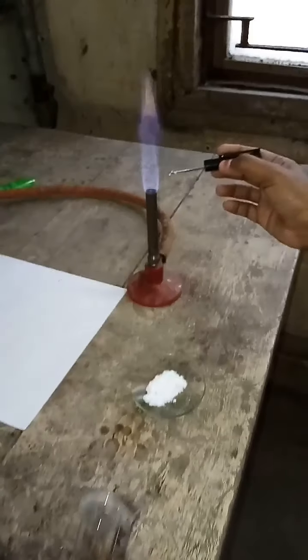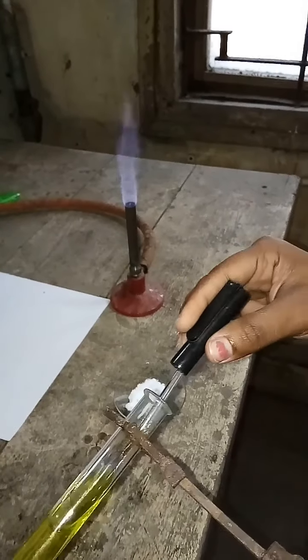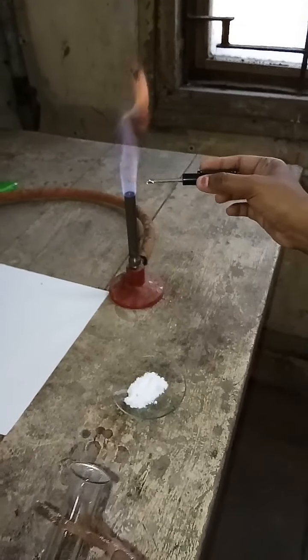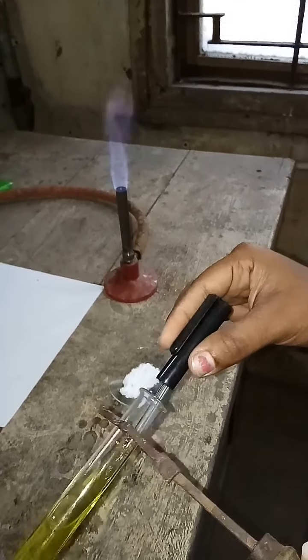Hello students, today we are going to do salt analysis of solution number 13. This is your original solution (OS) of solution number 13. We start with our salt analysis with the first section, that is preliminary tests.